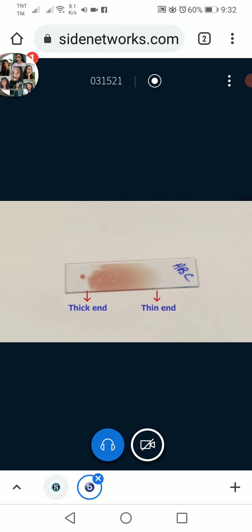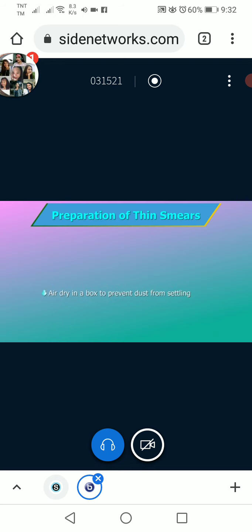The thin feathered end should be at least 2 centimeters long and the film should occupy the central area of the slide with free margins on both the ends. Air dry in a box or other container to prevent dust from settling on the slides. Do not dry with heat.